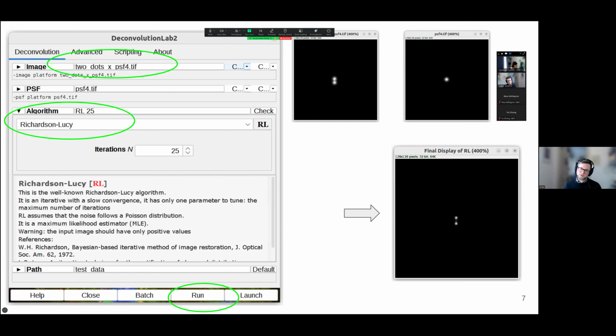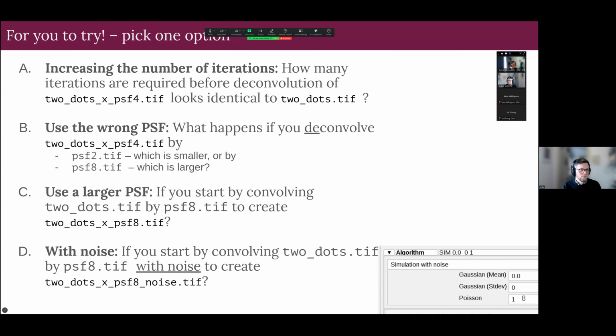And to actually deconvolve using the perfect point spread function and no noise and so on, it's sometimes called the inverse crime, because it typically looks a little too good if you do it like that. So what we will do next is a little more interesting.